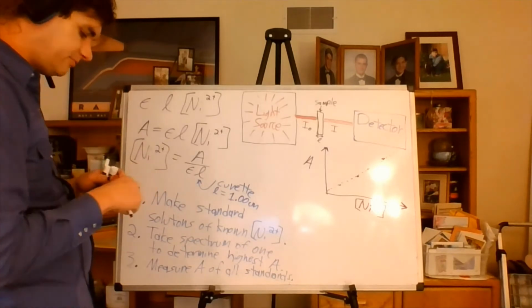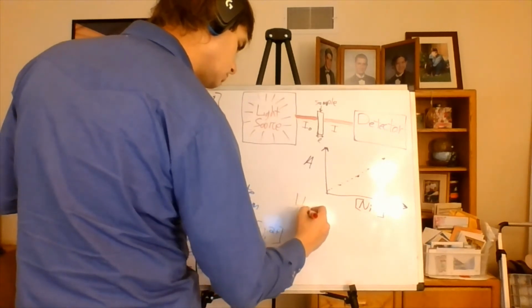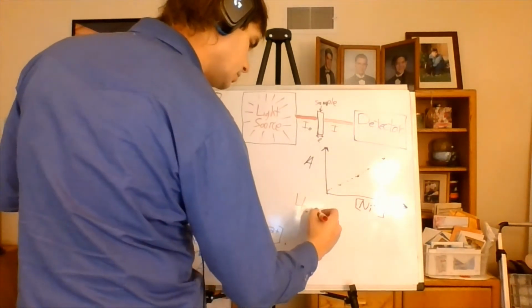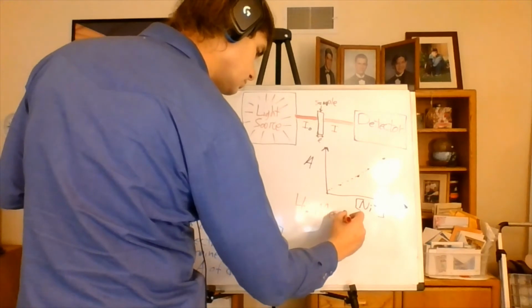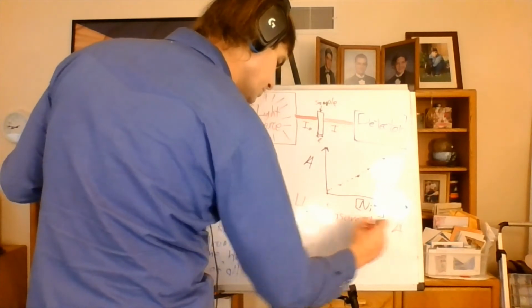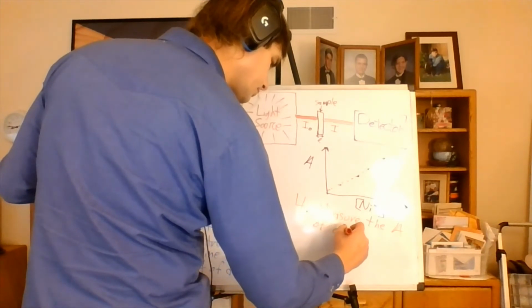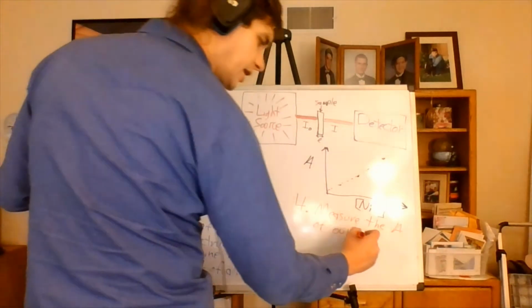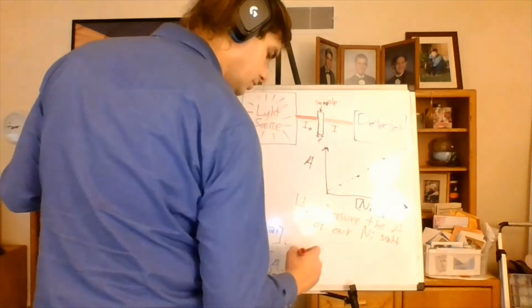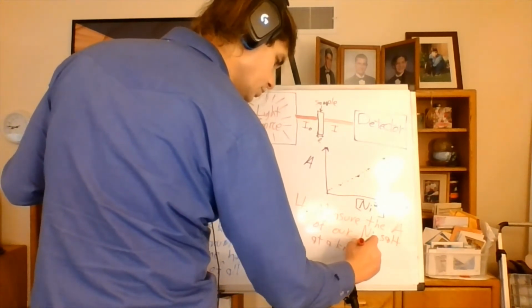Then finally, step 4, we want to measure the absorbance of our nickel salt at a known dilution.